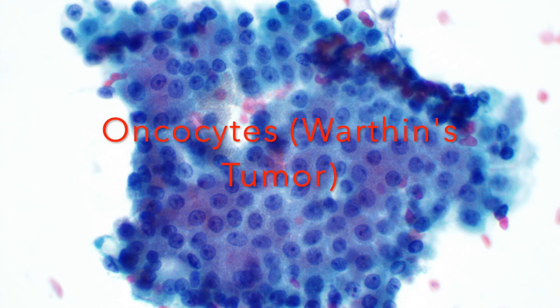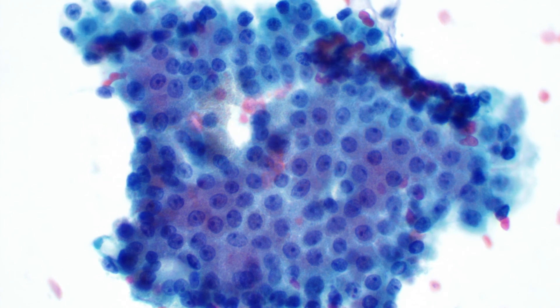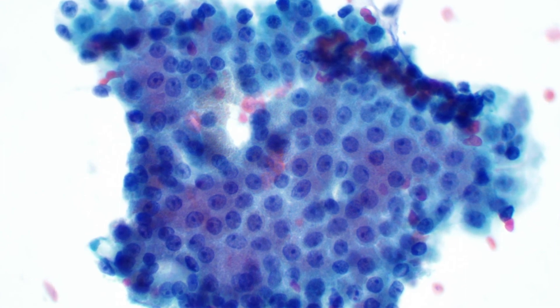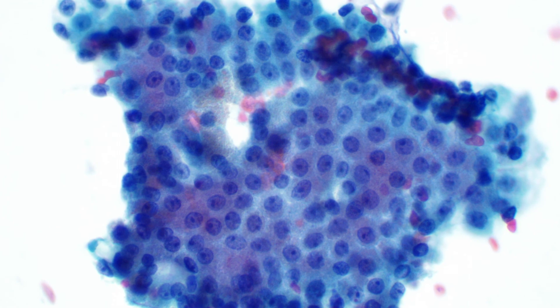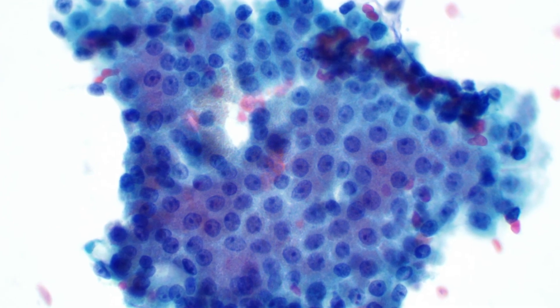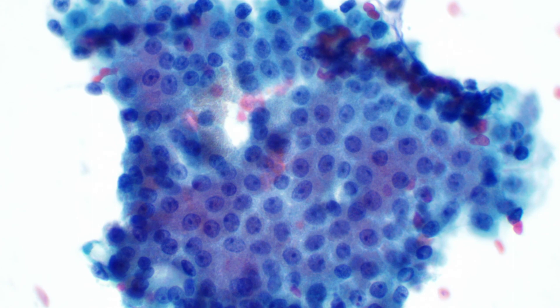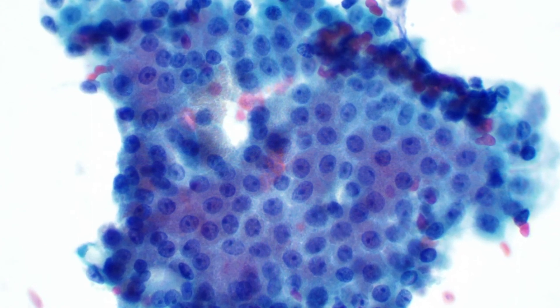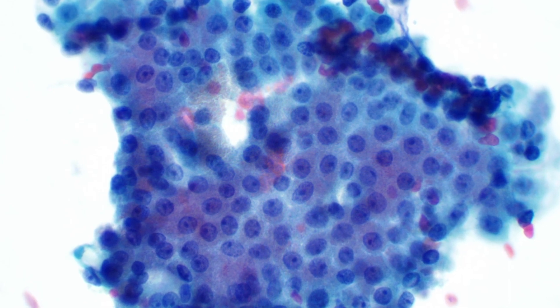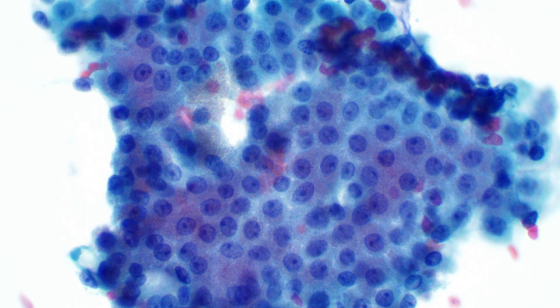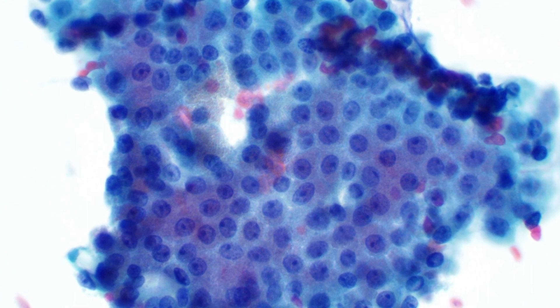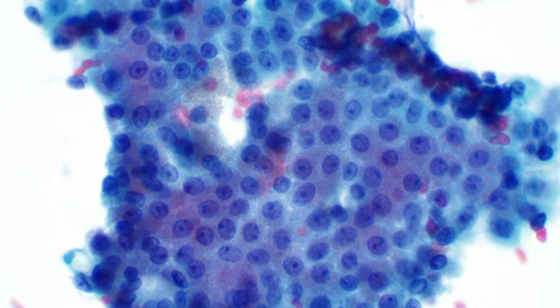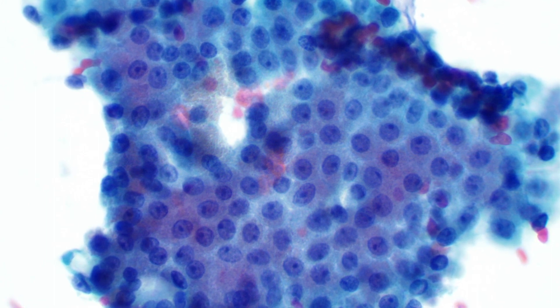The cells we see here in this image are actually oncocytes, which represent a metaplasia or a change of the cells. Oncocytes can occur in a few different areas of the body — salivary gland, thyroid, and the kidneys. When we see them here in the salivary gland along with a background of lymphocytes, which are a type of chronic inflammatory cell, this is suggestive of Warthin's tumor, a very common benign neoplasm that occurs in the salivary glands. Typically the patient has a history of smoking, and these might occur bilaterally — the patient might have these nodules on both sides of their cheeks.